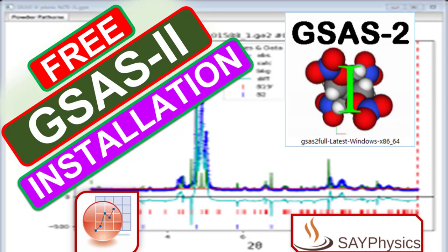In this video we will discuss how to install the GSAS software, which is an open-source software for x-ray diffraction data analysis.